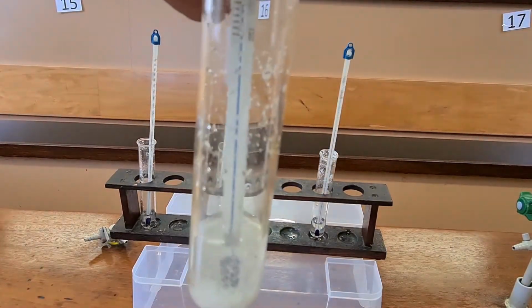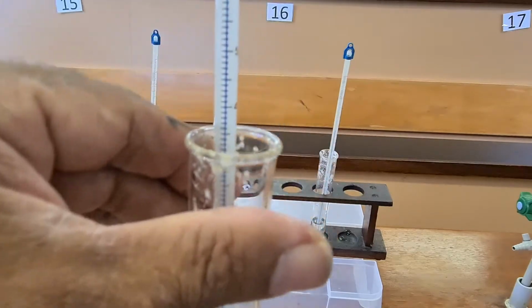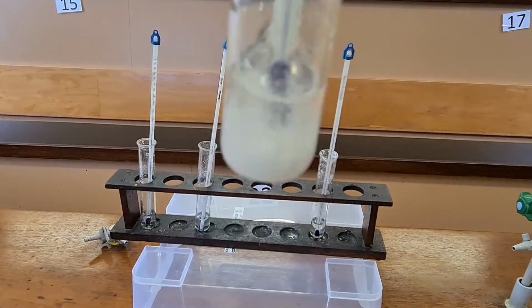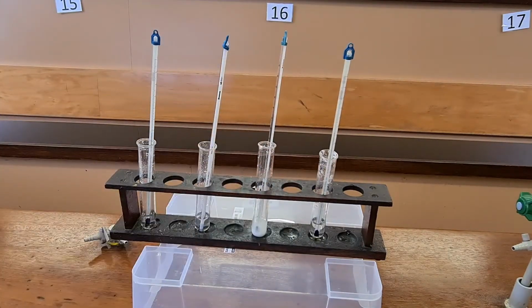This third one, C, has started forming crystals at about 65 degrees. Look, 65 degrees. And can you see the crystals forming? So the third one, C, is 65 degrees Celsius. I'm just writing it down on the board, which you can't see.